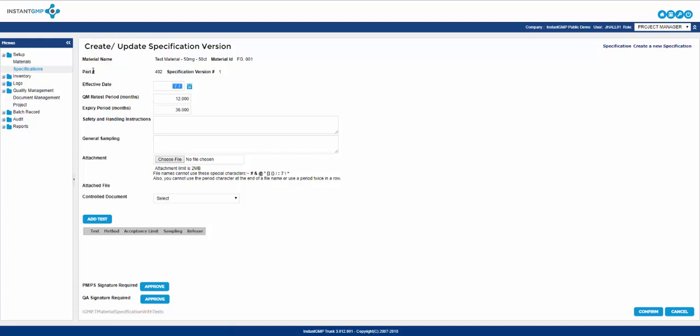Following this you can enter the safety and handling instructions which normally consists of proper PPE, how to clean up spills, etc. The character limit is high which allows for detailed instructions to be entered. General sampling is where you will enter the total amount to be sampled for any type of QC testing. If you wish to highlight how to prepare these samples you have a high character limit to do so.